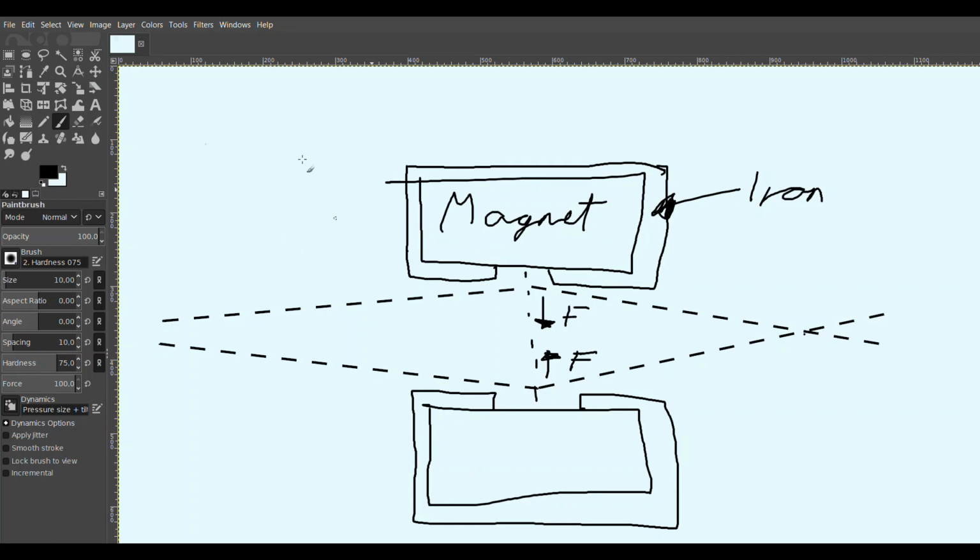But either way, these want those to go towards the middle here, and depending on the distances, this might get bigger than it was or smaller than it was. Here it was supposed to get smaller, but I think actually it's bigger, but please ignore that. Also this corrects, it concentrates it.